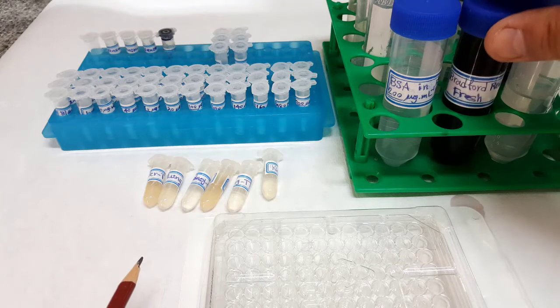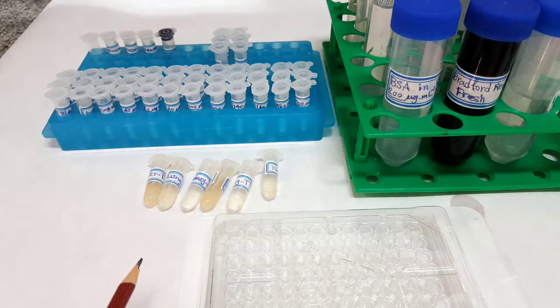50 milliliters of Bradford reagent is prepared by dissolving 5 milligrams Coomassie Brilliant Blue G250 dye in 2.5 milliliters 95% volume per volume ethanol, followed by addition of 5 milliliters phosphoric acid. The solution is further diluted with distilled water to 50 milliliters.